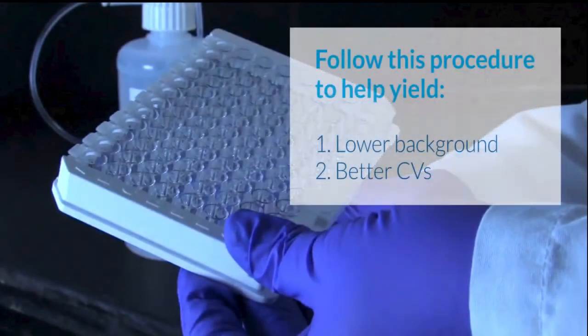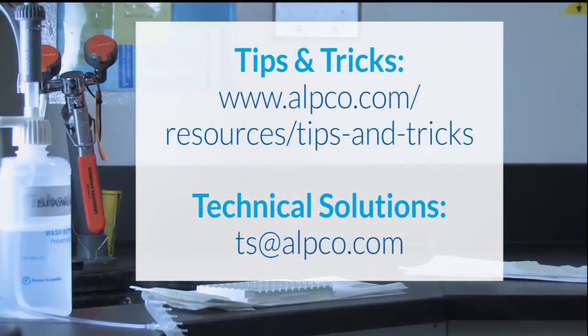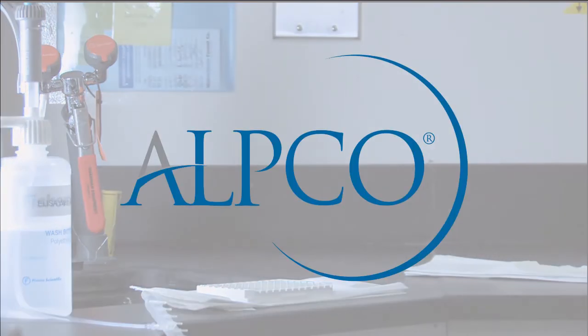Following this procedure to manually wash an ELISA plate will help yield lower background and better CVs. To learn about other ELISA tips and tricks, visit alpco.com. If you need more help in the lab, you can also email ALPCO's technical solutions team at ts@alpco.com.